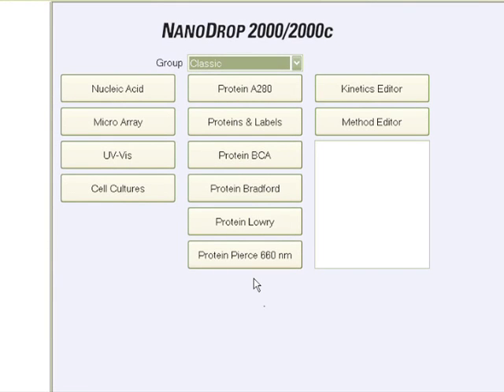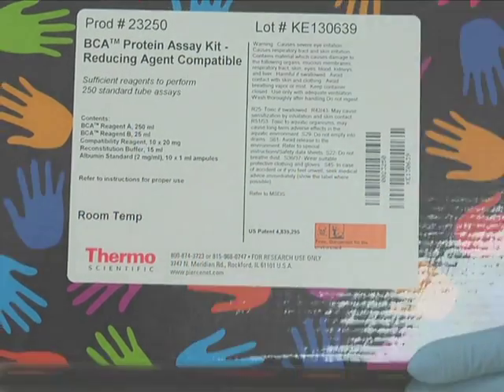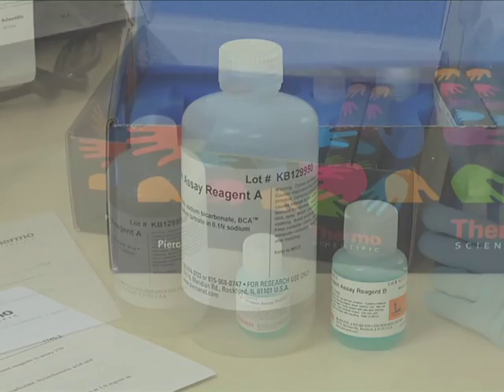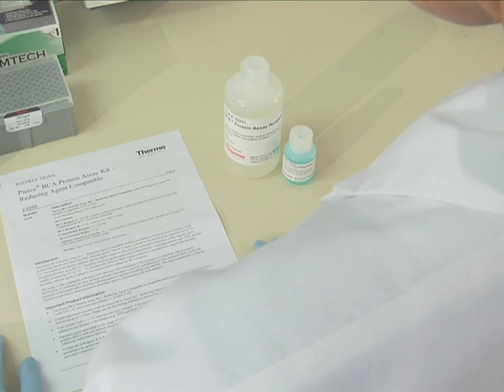If the sample is an uncharacterized protein solution, cell lysate, or crude protein extract, we recommend using one of the pre-configured colorimetric methods available on the NanoDrop 2000C. These colorimetric methods include BCA, Pierce 660, Bradford, and Lowry assays. The BCA assay will be demonstrated here. The required reagents are contained in the Thermo Scientific Pierce Reducing Agent Compatible Kit: BCA Reagent A, BCA Reagent B, and Bovine Serum Albumin Standards. We will be using Pierce's pre-diluted albumin set as our standards.